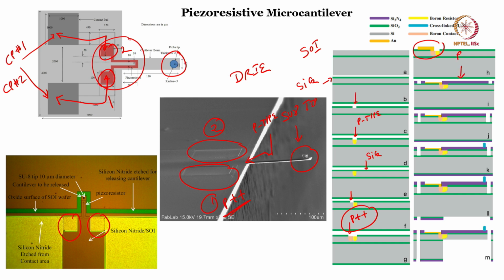deposition using PECVD because it is a technique which is used at lower temperature for growing silicon nitride and silicon dioxide. After that you can create a window, as you can see here, here and here, right. Then you can etch silicon, after etching silicon dioxide. So when you create a window you see silicon dioxide. This silicon dioxide you can etch using BHF.